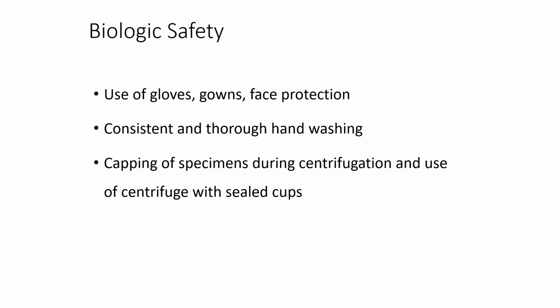Another aspect of biological safety is the use of gloves, gowns, and face protection. Consistent and thorough hand washing is especially important. Even though you are wearing gloves, there are certain particles that can go through the gloves and get directly on your hands, especially in the microbiology area.